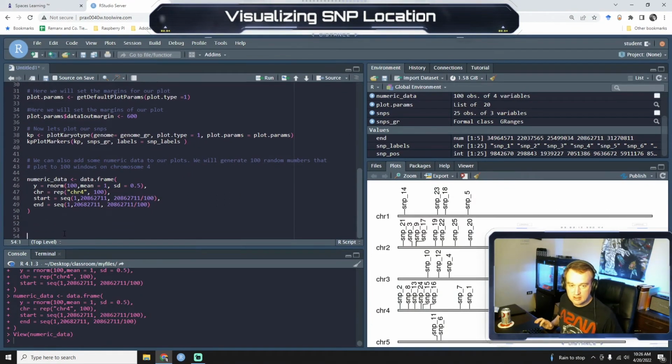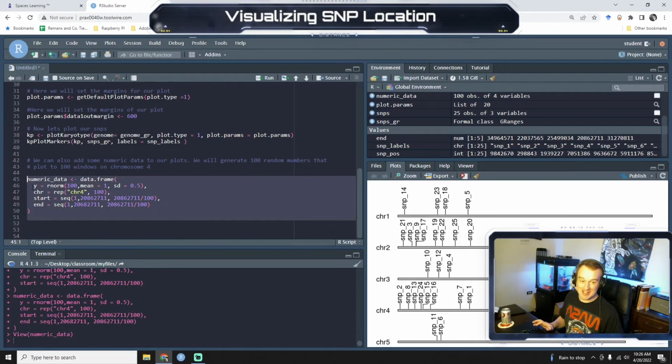I spent some time trying to fix that, and I just retyped it and it worked. So I don't know where my typo was. I'm sure there was one. But if you type this code in right here, it should work for you.